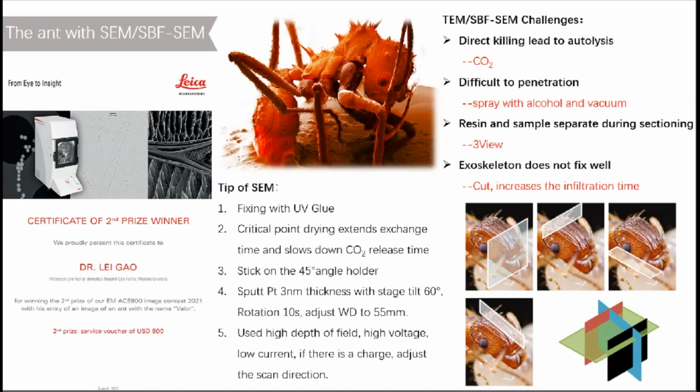After killing the ant with carbon dioxide, to preserve the structure, I cut the head into 8 parts, just like cutting a watermelon.